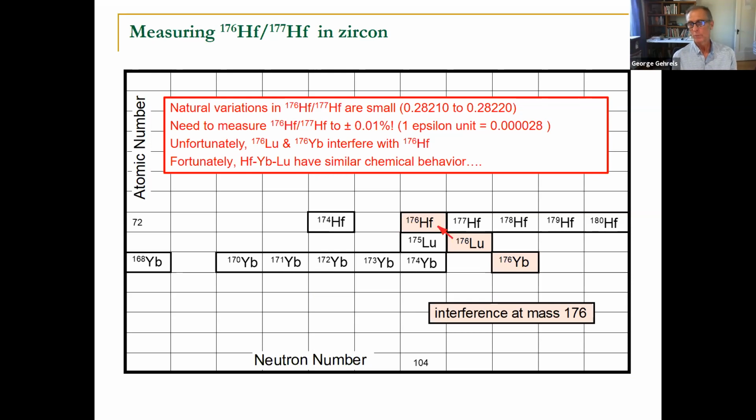When you come to a lab, you can probably show up in the morning and they'll do a little fine tuning and adjusting, and maybe by 9:30, 10 o'clock, you'll be off and running, getting good uranium lead ages. You come to a lab to do hafnium isotopes, and you probably will have time to go get lunch. You might even have an afternoon tea break before you're ready to start generating data. Hopefully it happens on your first day and you don't have to spend the whole day watching them tuning and fiddling. But this is a technique that's much more challenging than uranium lead geochronology.